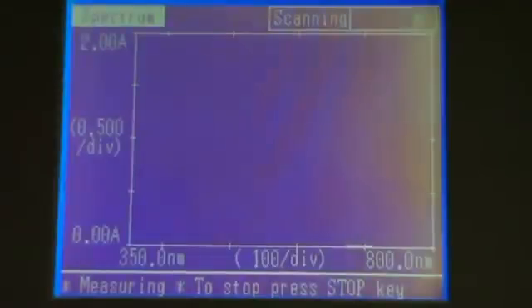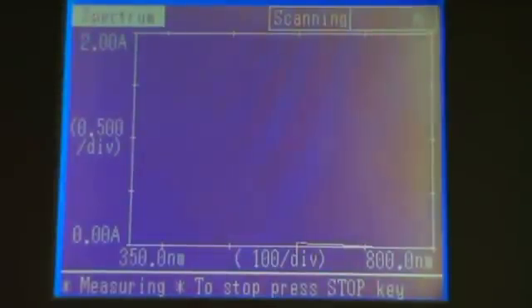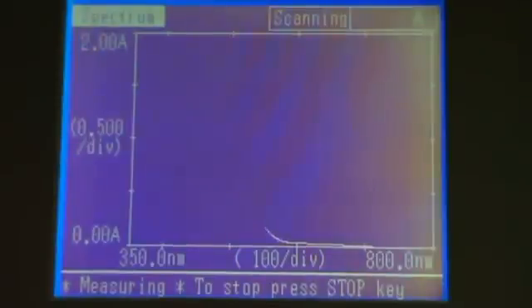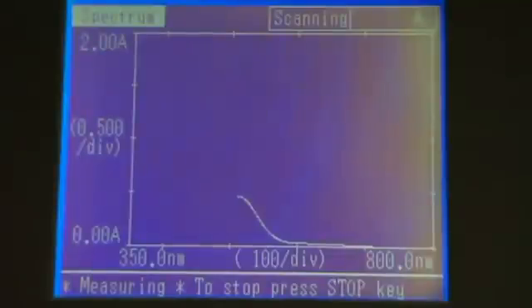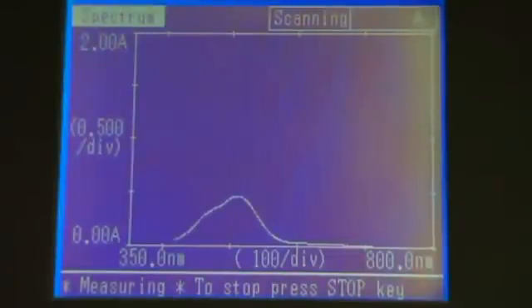The instrument will scan the absorbance of your sample across the wavelength range you have selected. In this case 800 to 350 nm. If the sample absorbs in this region we will see an absorbance peak.